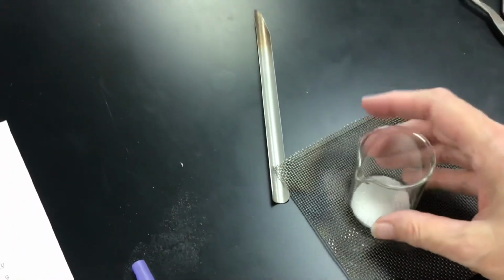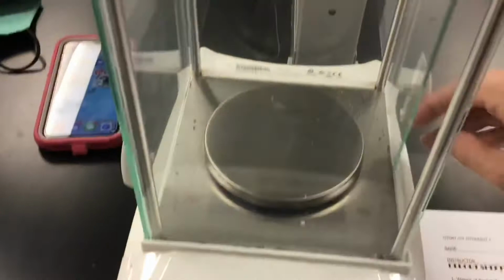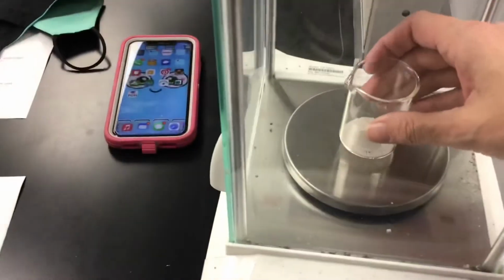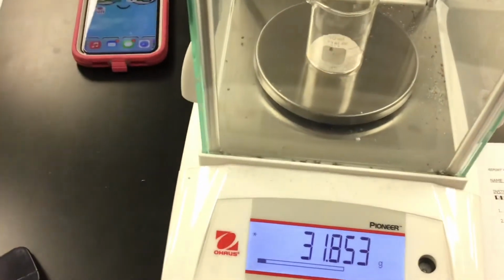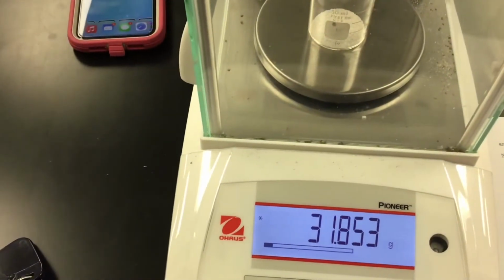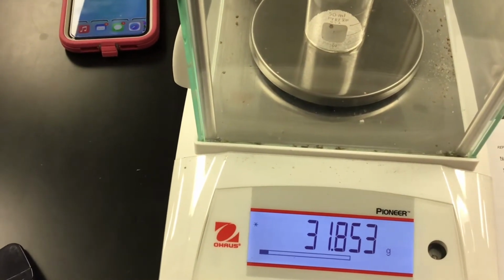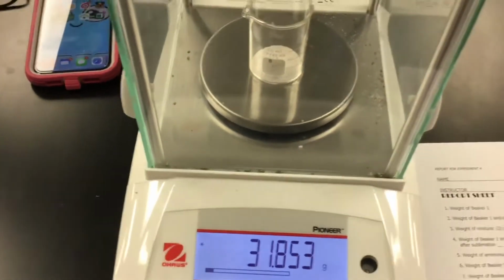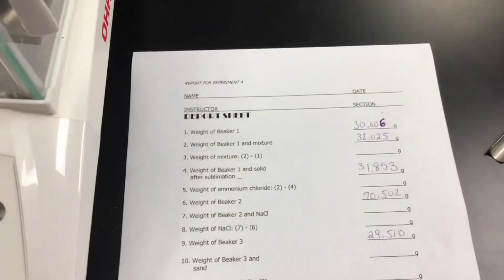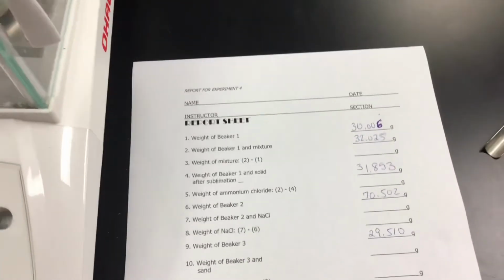Alright, so now I can touch it. And so now I check my balance. Let's tare it out, it's 0. So I'm going to open it up, and I'm going to stick my beaker 1 in. And so my mass of beaker 1 of solid after sublimation is 31.853. Alright? And again, it should be less because I sublimed out that ammonium chloride.